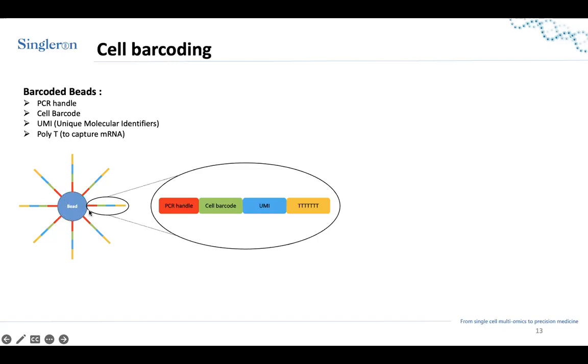So you have a bead that's actually very small, bigger than a cell, definitely. It has a metal core, so it will be attracted when there is a magnet in the neighborhood. It has a metal core and it is coated with some oligonucleotides. And this oligonucleotide has a specific structure, shown with red, green, blue, and yellow.